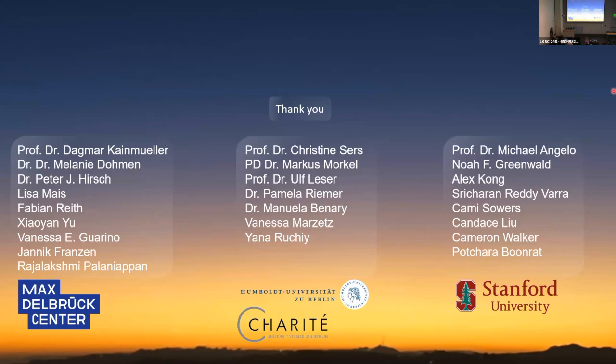Noah and Lorenz really drove this whole thing, and conceptually the goal was to have something that factors in human level intuition with looking at expression patterns around cells. And then two, to have something that was panel agnostic, so that you could use this on anything without having to worry about if your panel fits bespoke things for certain cell types.